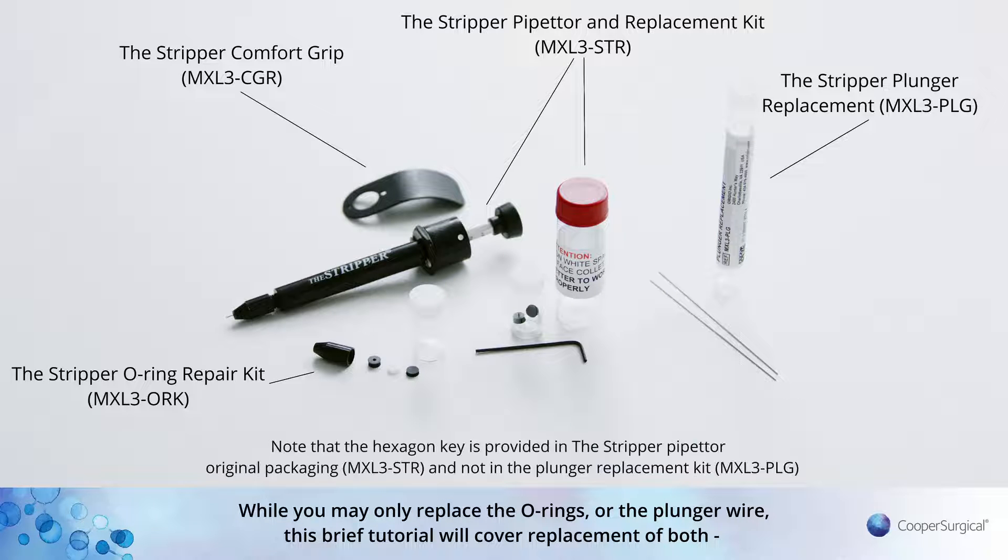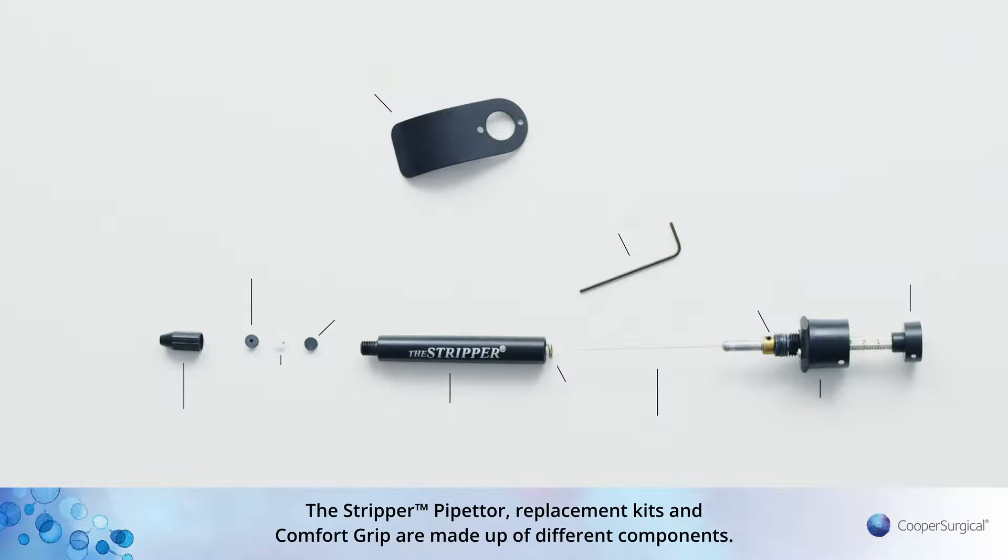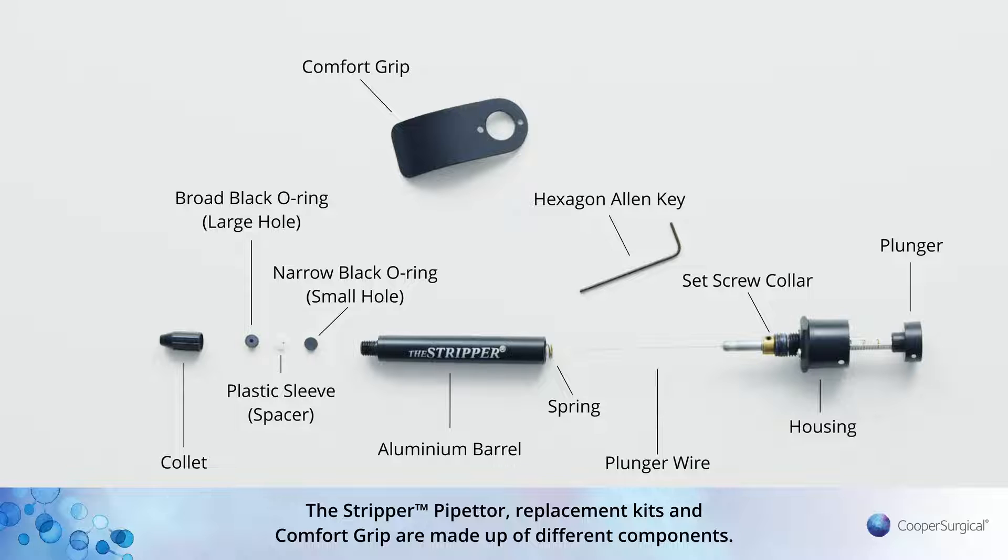While you may only replace the O-rings or the plunger wire, this brief tutorial will cover replacement of both and additionally show you how to assemble the Stripper Comfort Grip. The Stripper Pipetta, Replacement Kits and Comfort Grip are made up of different components.